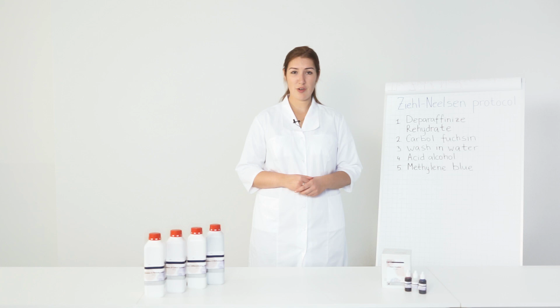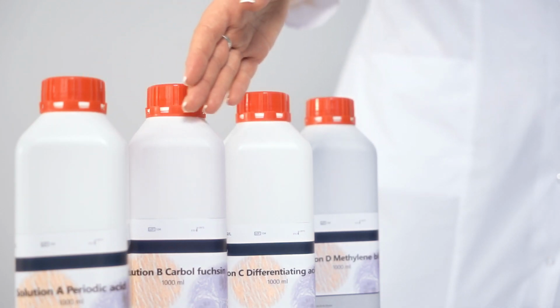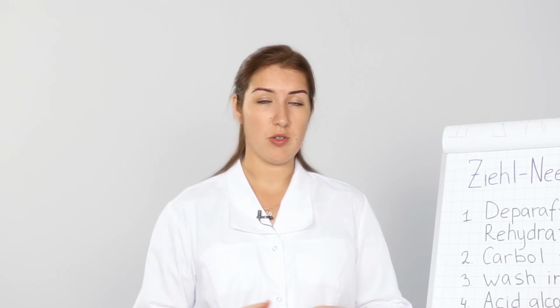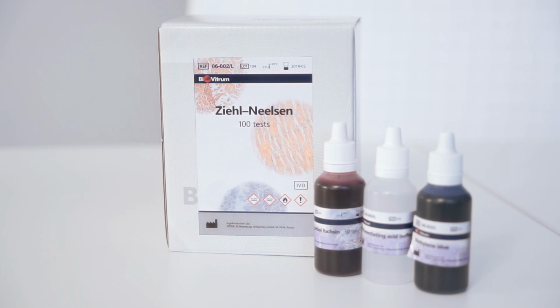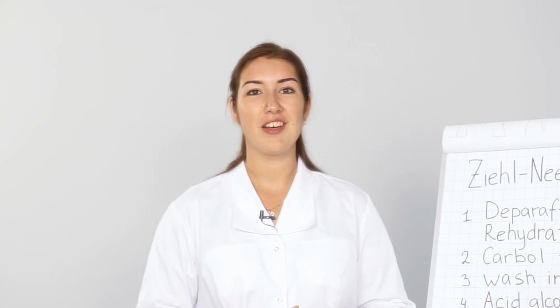Nowadays, there is a wide variety of ready-to-use staining kits from different manufacturers. If you follow the protocol given by the manufacturer, you will be able to achieve good results of staining. Concentrations of the solutions and time of exposition are chosen to get a fine color scheme.